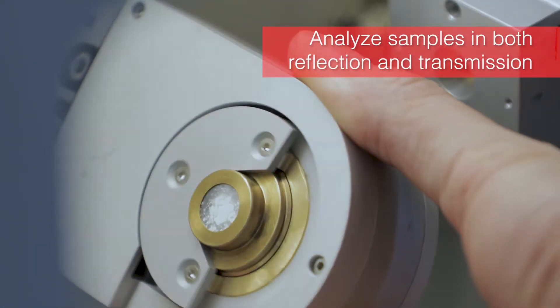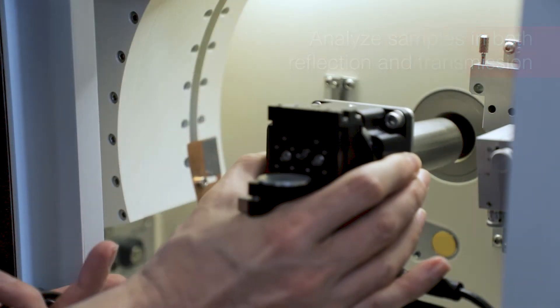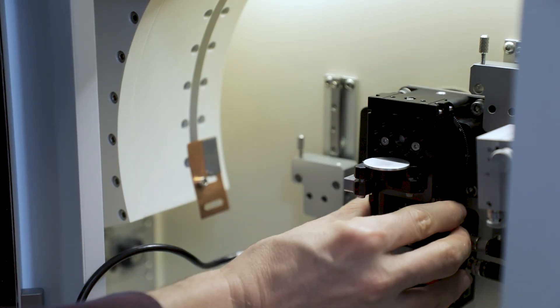The ARL Equinox 100 can be adapted for several sample types in various analytical conditions. Sample adapters are easily switched in a matter of seconds with no realignment needed.